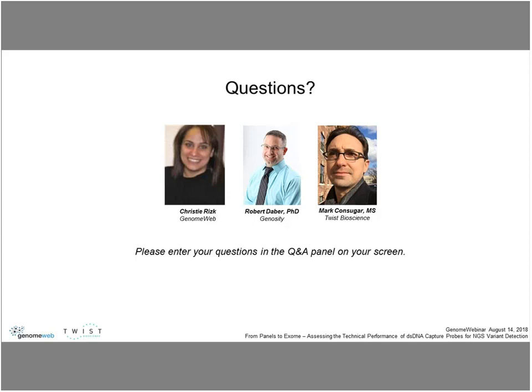Great, thank you. And what was the read length that you used for the exome sequencing? Our listener is assuming 150 base pairs, but is that correct? That is correct, paired end 150 by 150. Great. And which enzymatic fragmentation method did you use? So Twist has it in their kit, and in our evaluation, we had tested Kapa HyperPlus, as well as Archer has an enzymatic shearing enzyme that we worked with.